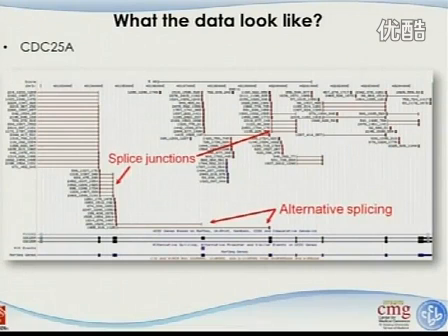And we have seen many of these spans, the so-called junction reads, which means that for this particular read, one end is in this exon and the other end is in that exon. Bringing this together, we see an interesting alternative splicing event, and this read gives us evidence that these two exons are together and splicing occurred in this way.